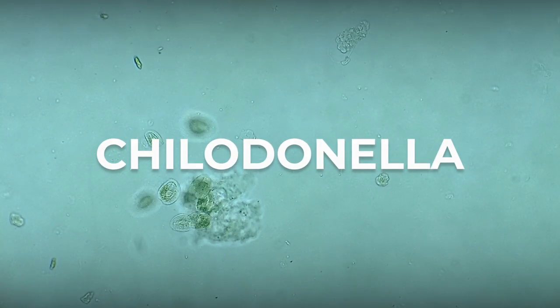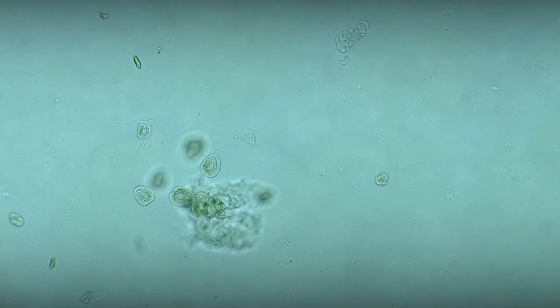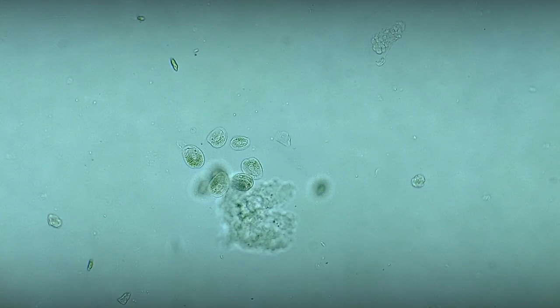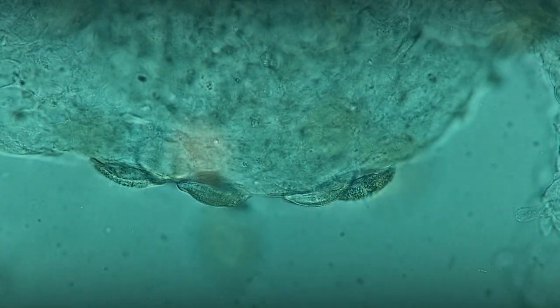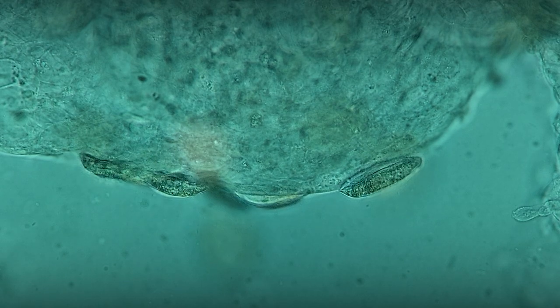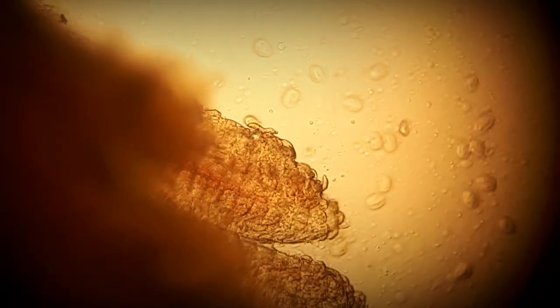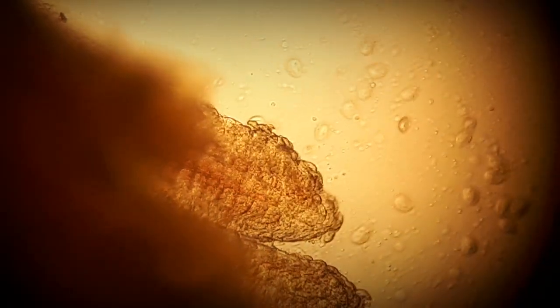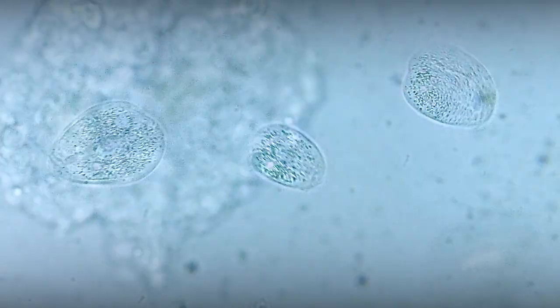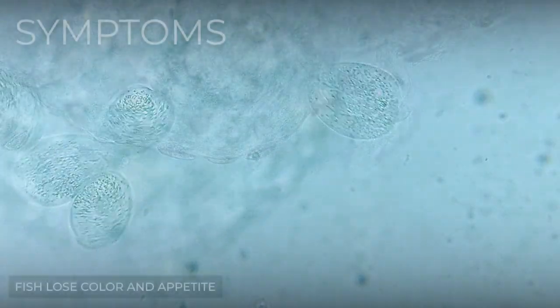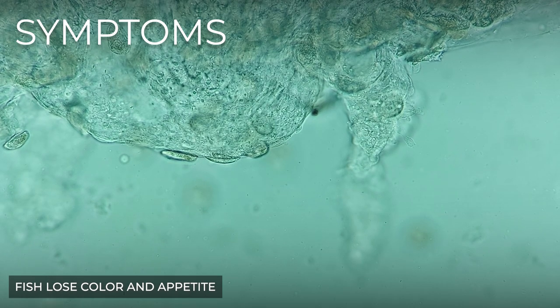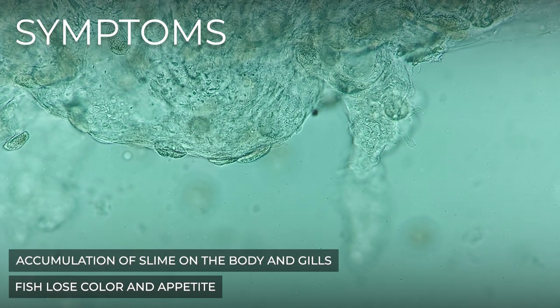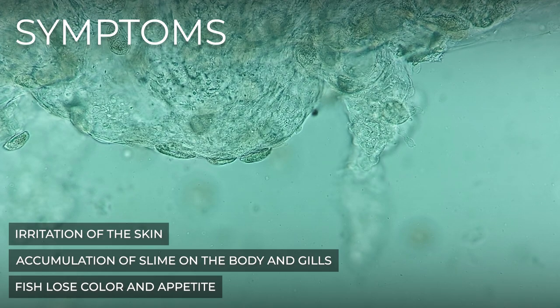Tricodinella is one of the three described genera in the family Tricodinellidae, which includes about 50 species. Tricodinella looks like a baseball cap or a heart. It causes loss of color and appetite, accumulation of slime on the body and gills, and irritation of the skin of fish.